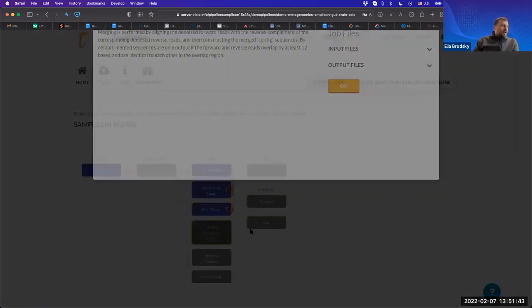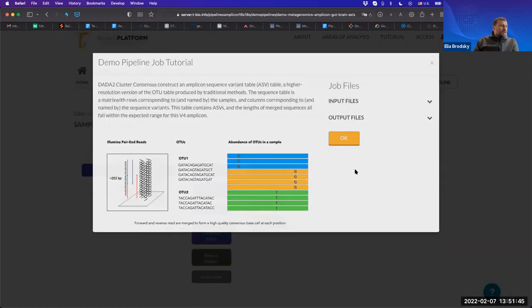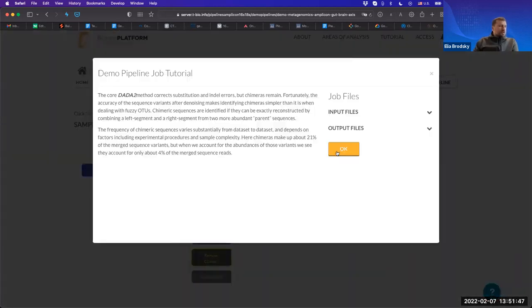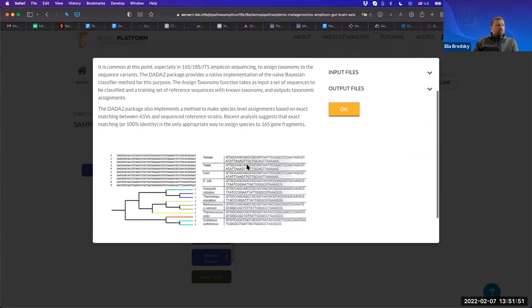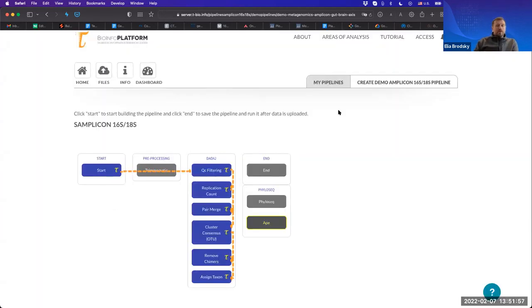So once we do this, I'm going to quickly go through some of these steps. We want to assign those to the right reference in this database. And assigning them means that now I can not just speak about individual OTUs, operational taxonomic units, but I can group them by whatever level of taxonomy I was able to annotate them by.